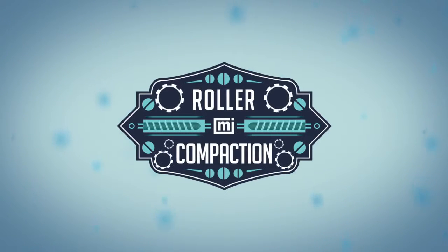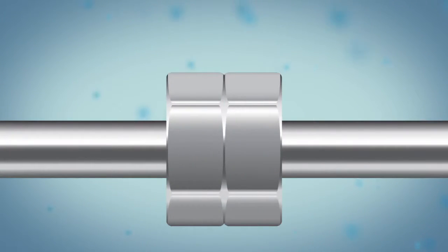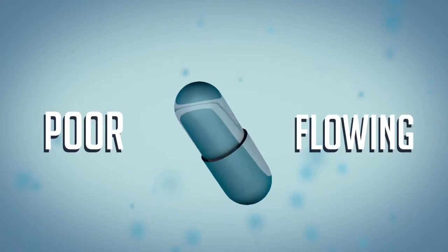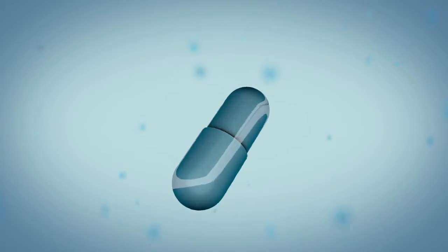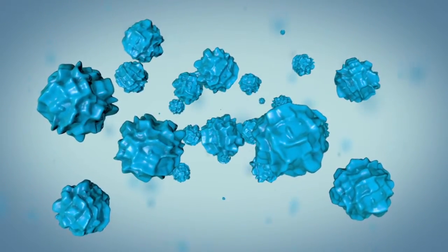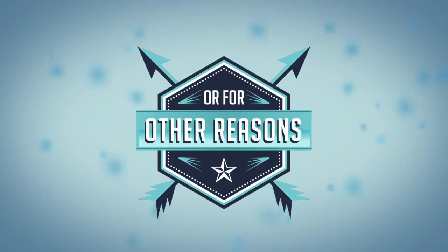Roller compaction is a dry granulation technique used in pharmaceutical manufacturing to make coarse granules prior to compression or encapsulation. Primarily used for poor flowing materials, it can also be used when segregation may be an issue due to large differences in particle sizes for various components of a formulation, or for other reasons.